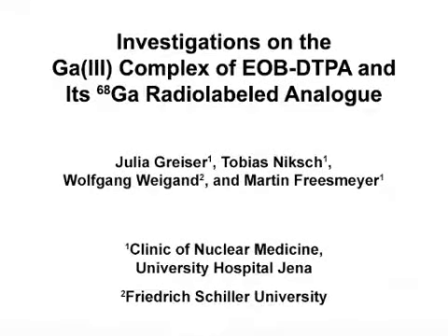The overall goal of this procedure is to evaluate a new radioactive gallium-68 complex for molecular imaging. This method can help answer key questions in the field of gallium-68 tracer chemistry, such as labeling conditions, tracer stability, and lipophilicity. The technique of radioactive labeling is straightforward and allows for fast determination of results while requiring only minimal amounts of material.